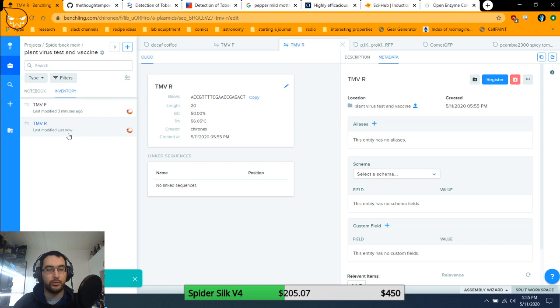So in theory, I'm going to have these made because it only takes 2 days. If I order these tomorrow, then I'll have them before Friday, basically. My plants, other than being a little bit speckled, still look pretty healthy, so I'd have enough time to deal with this. But at the very least, I could know. I'm going to be really careful and keep things really sterile and not contaminate my entire apartment. I can run this reaction and find out if this works.